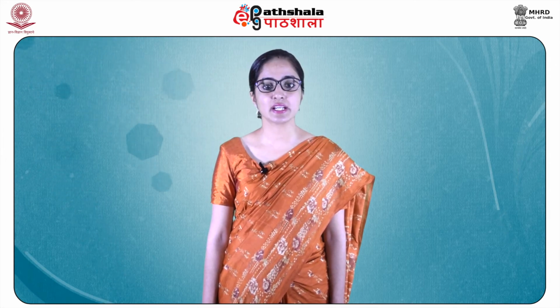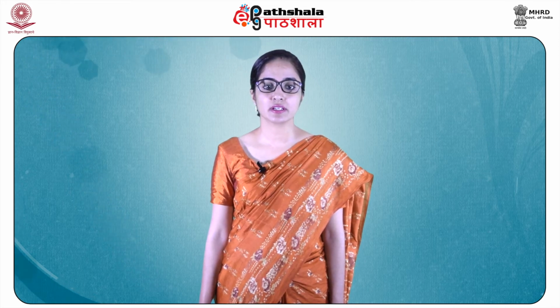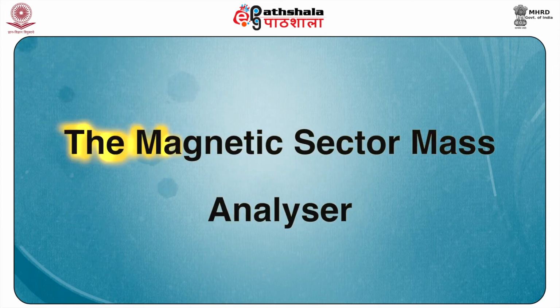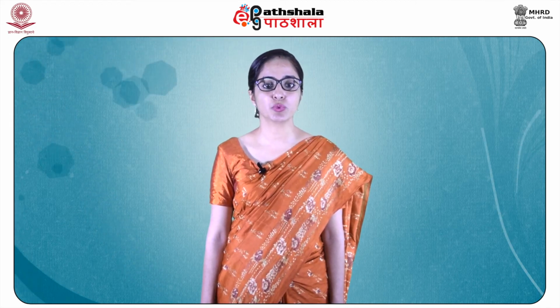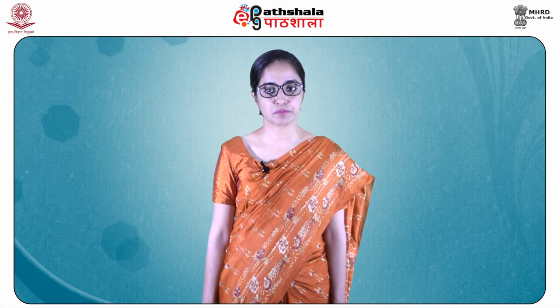Just as there are different ionization methods, there are varied analyzer methods also for varied applications. The first one is the magnetic sector mass analyzer. In this type of analyzer, the ions are passed between the poles of a magnet. In the presence of a magnetic field, the ion describes a curved flight path.